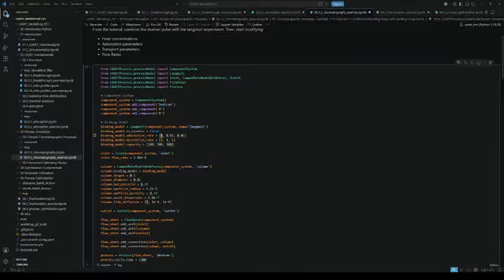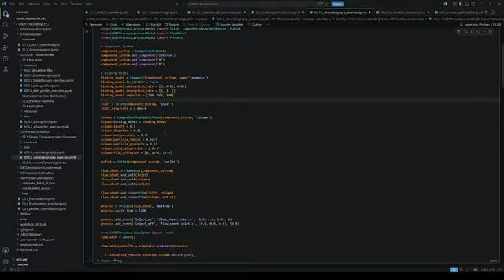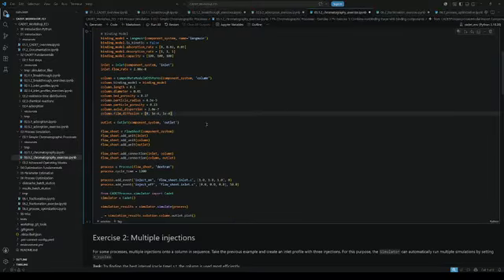As you can see, this dextran cannot adsorb to the surface. The rest is quite similar. The only difference is we are now using a lumped rate model with pores and not without pores. As explained before, this adds another layer of complexity to our system. We are actually now simulating pores. So now we need parameters for the system like particle radius, particle porosity, and film diffusion. So this is the mass transfer coefficient that calculates the resistance of the molecules going into our particles.